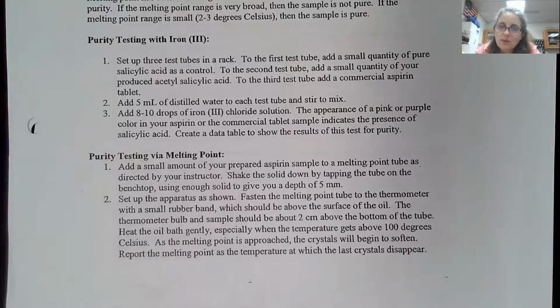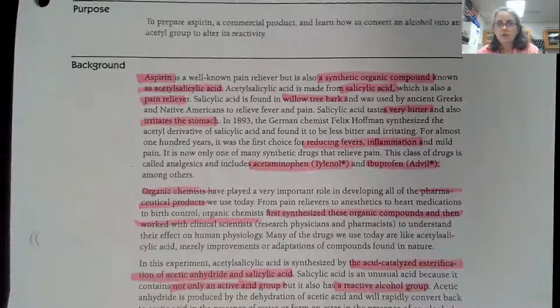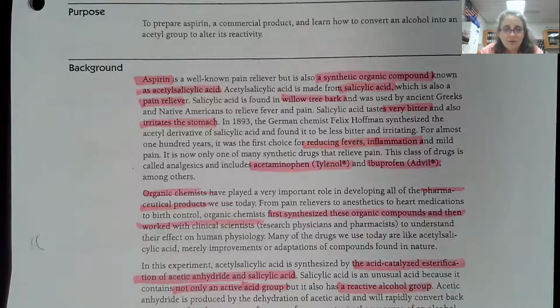And then another day, we're going to do what we call the melting point. So we're actually going to take some of the solid and melt it. We're going to put it into a beaker of mineral oil, and we're going to heat it, and we're going to see what the actual melting point is of your aspirin. So that is basically the summary of this lab, and it is a good resource for you to answer some of the questions.